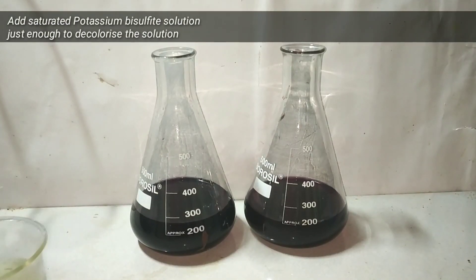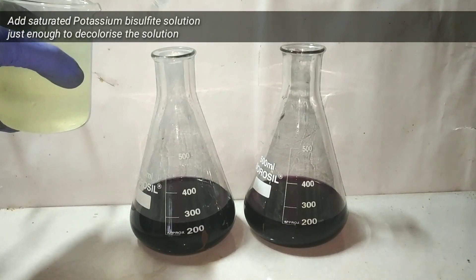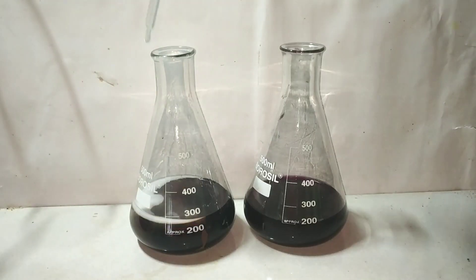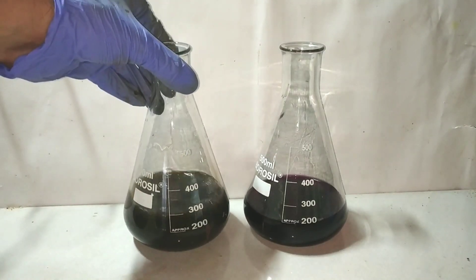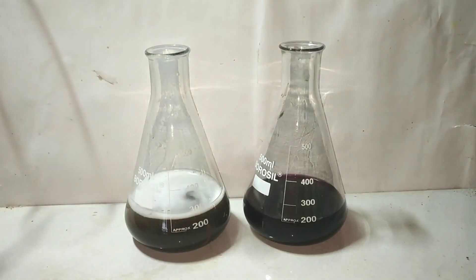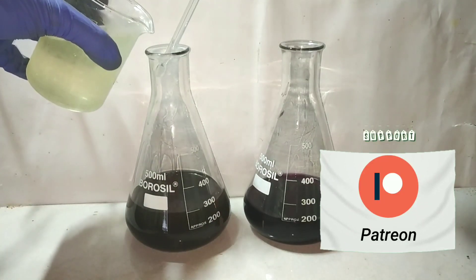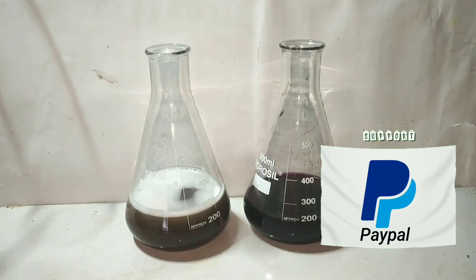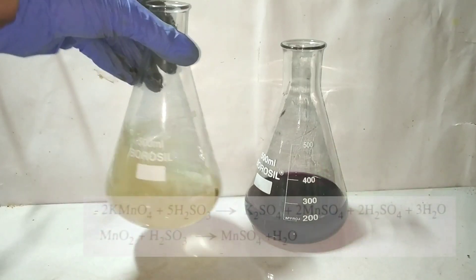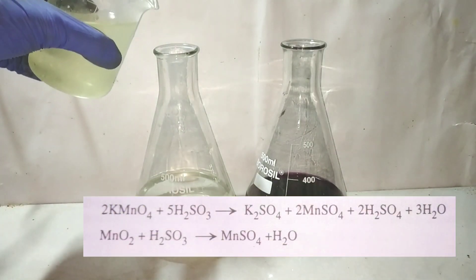After filtering, we will decolorize the solution by adding potassium metabisulfite. I had made a saturated solution of the metabisulfite and I add it into the mixture and shake well. You can see it is slowly getting decolorized on adding the metabisulfite and on shaking. Now I will do the same with the other flask.